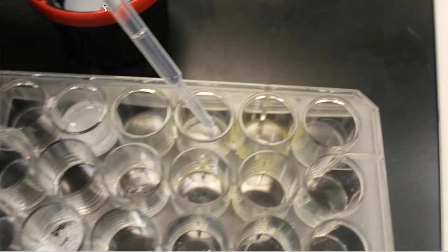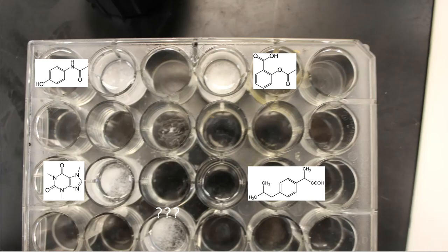And that gives me an idea of what 1 milliliter is. So I add 2 milliliters of ethyl acetate using a disposable pipette into each one. All right. So here is the order of which I did them.